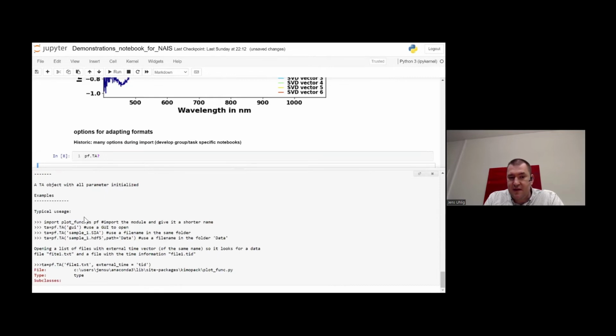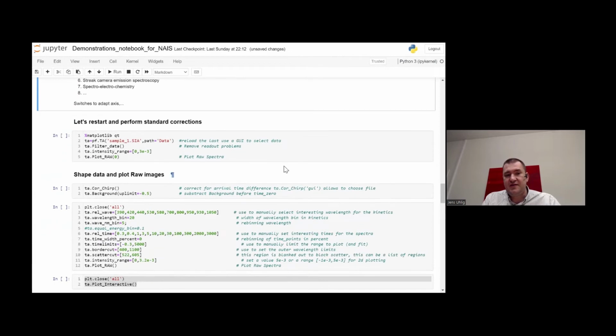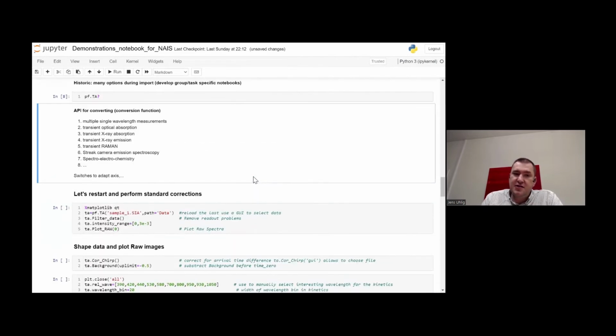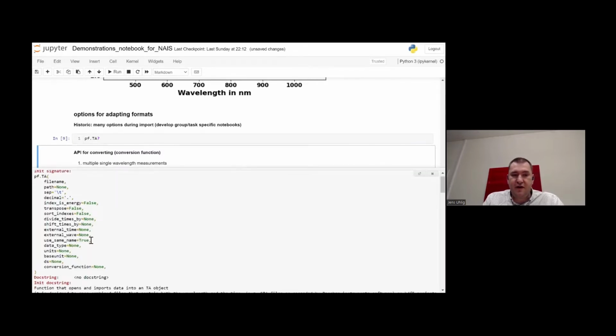There are also example files, but I would like to highlight that nobody is expected to write that code fresh. I always use the notebook. I have example parameters in there and I just adjust them. But for these choices, I can import data in many different ways from one or two different files.